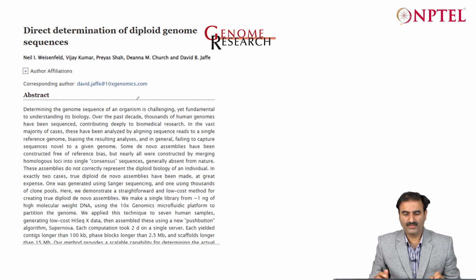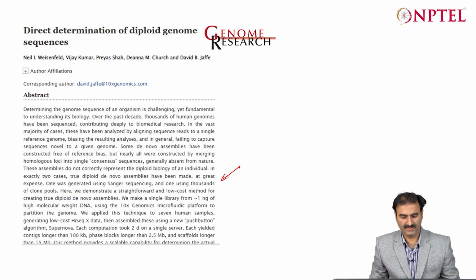Okay, so the paper for Supernova was published here, and this tells how the library can be prepared and also the later assembly components.